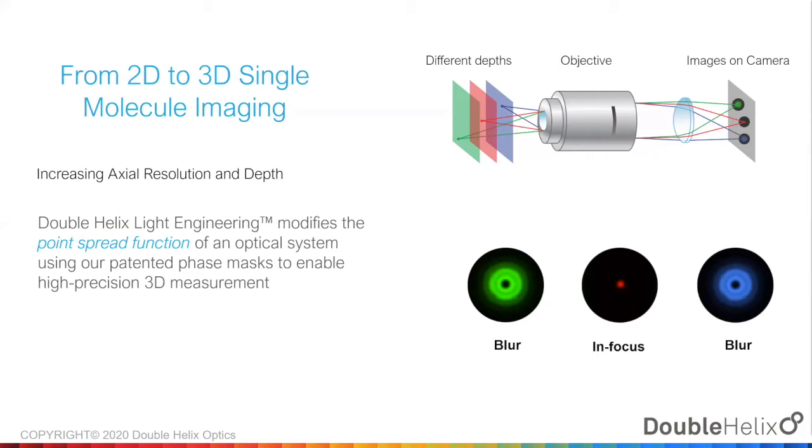When imaged with the standard microscope, the blurring of the Airy disk with axial defocus significantly reduces the signal-to-noise ratio of these molecules. Furthermore, the symmetric blurring around the focal position leads to ambiguity in the sign of the axial position. Lastly, the image of all molecules within the depth of focus of the objective look equally sharp, leading to further errors in their axial position determination.